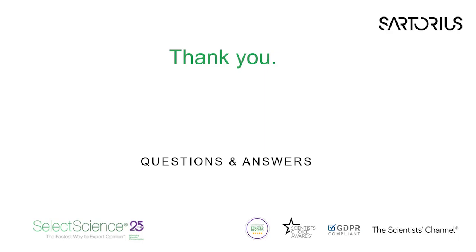I can't give you an actual time, but my recommendation is that when you're not using the pipette, put it in a pipette stand. Don't wander around with your pipette in your lab coat pocket. We've all done that. But of course, your body heat can also affect it. I can't give an exact answer on that, but it is something to bear in mind: when you stop using it, put it in the pipette stand and not in your lab coat pocket.